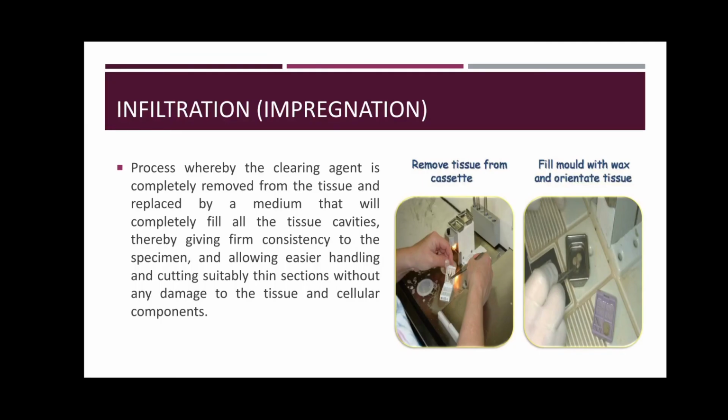Next step is infiltration, or otherwise known as impregnation. This is a process whereby the clearing agent is completely removed from the tissue and replaced by a medium that will completely fill all the tissue cavities, thereby giving a firm consistency to the specimen and allowing easier handling and cutting of suitably thin sections without any damage or distortion to the tissue and its cellular components.